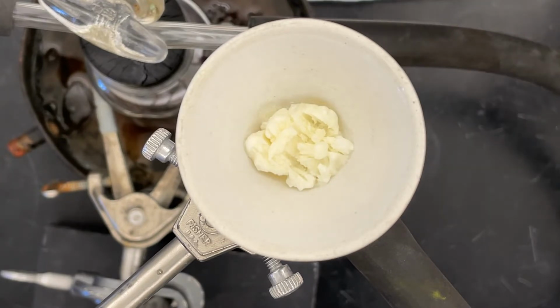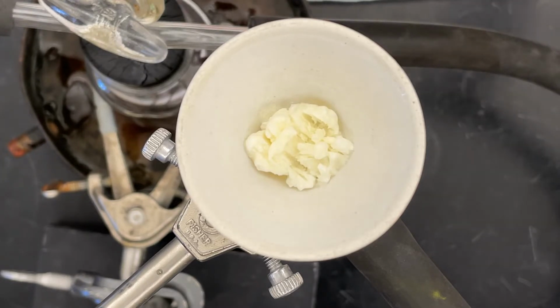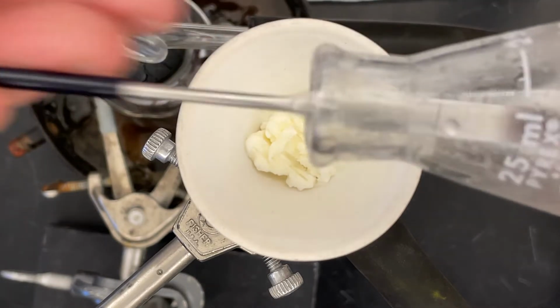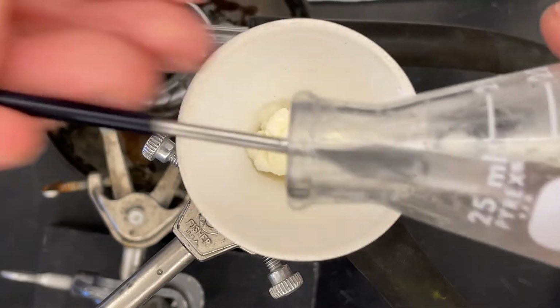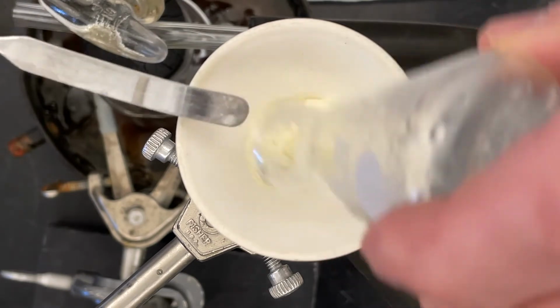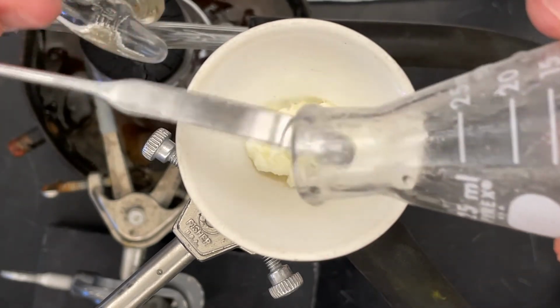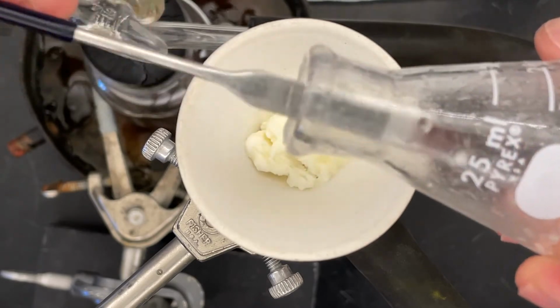I'll rinse the Erlenmeyer flask first. Try to loosen up a little bit more of those crystals. And the amount of water that we use is not super critical because the benzoin is really not soluble in water. So we can do a little heavier rinsing here than we would in sort of a recrystallization.